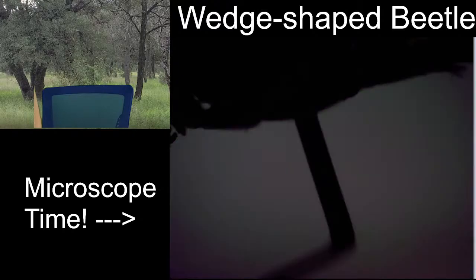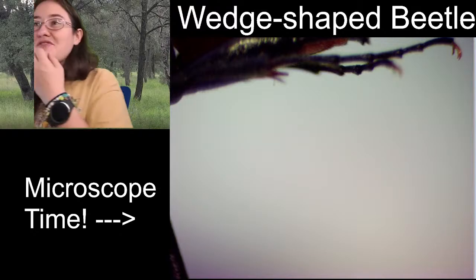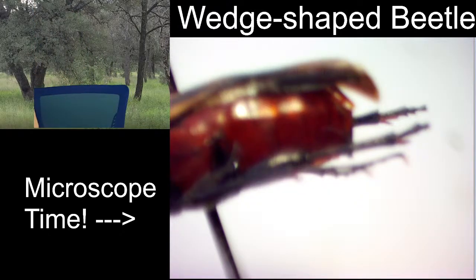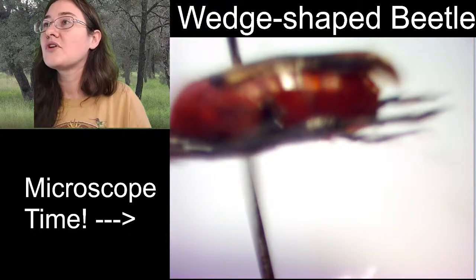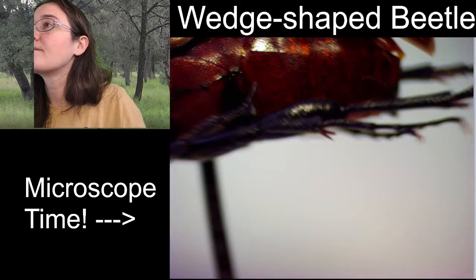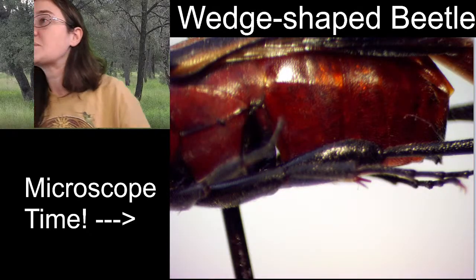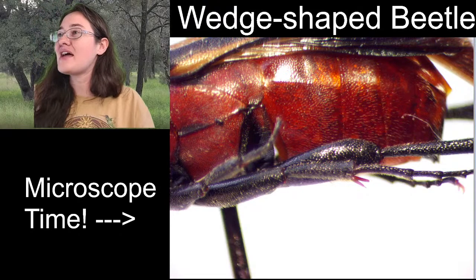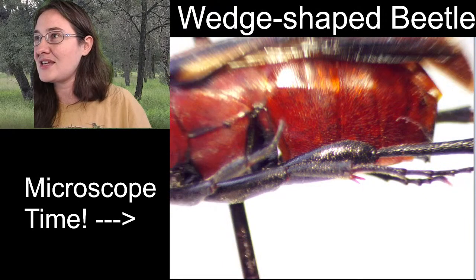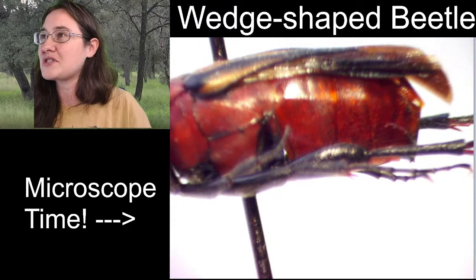Now, see, these all look like they have two tibial spines. I'm going to have to reassess. But here we go. Trying to get the focus on the right leg. Here we go. From this point, we can see the femur, the tibia, and the start of the tarsal segments, but we can't see the very end of the tarsal segments until right about here. It has really long tarsal segments. Okay.